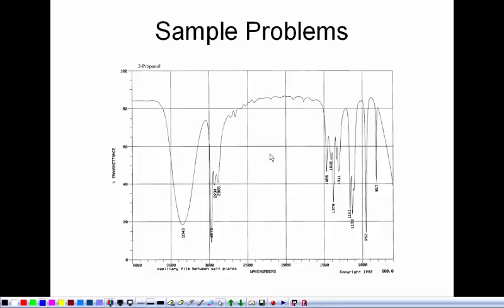Can you be more specific than a lot of absorption peaks? Well, specifically, the peak up by the 3000 range is there, really wide, so it should be alcohol. So it's an OH. This big broad peak here is an OH. So this molecule has an OH in it.